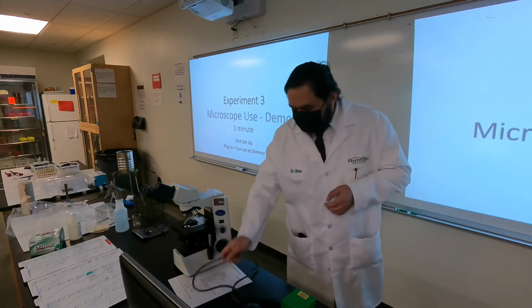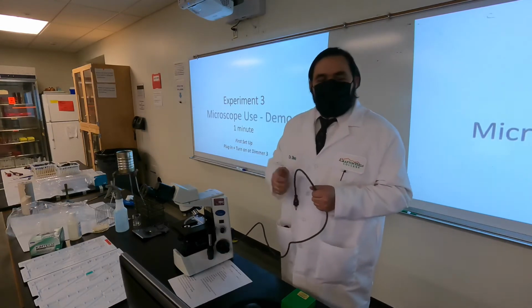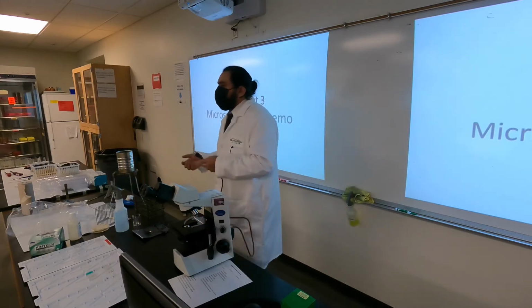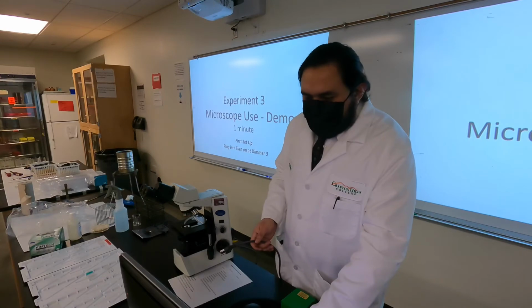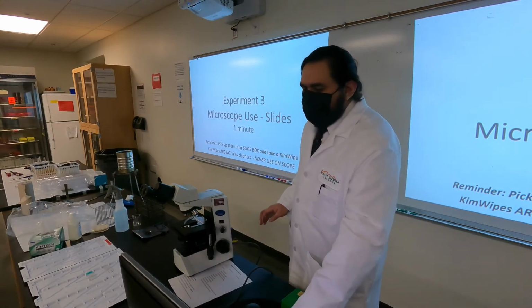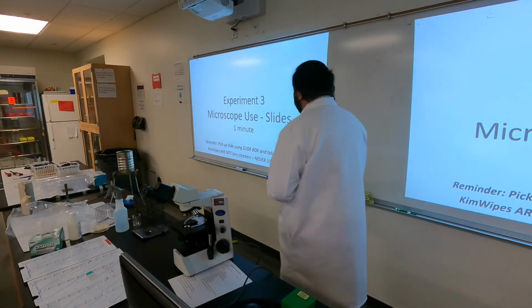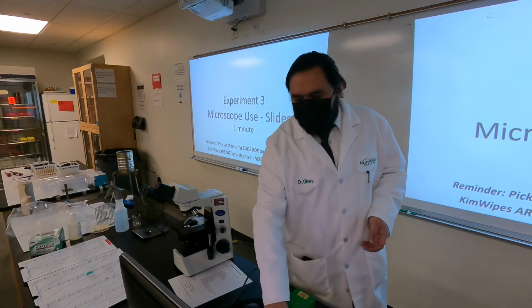Grab your cord, go find it in front of you, should be fairly close, plug it in, dimmer to 3, switch to on, center your slide, and then now we're actually going to use our very first slide, which is our triple strings one, and we're going to demonstrate the concept of parfocality, okay?